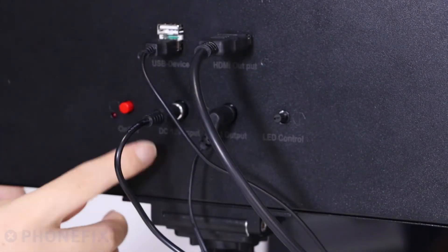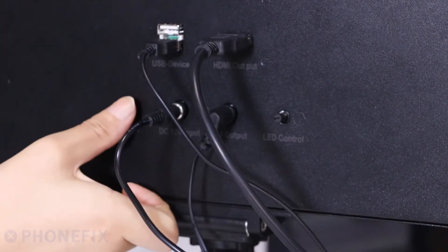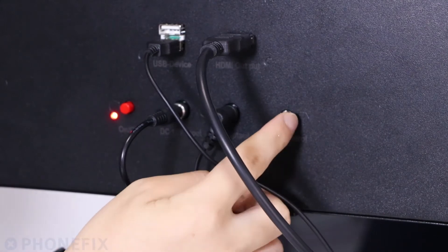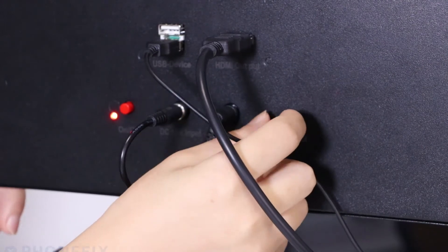Turn on the switch and adjust the focus.